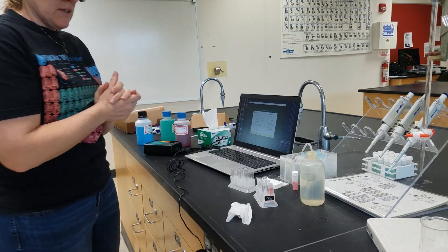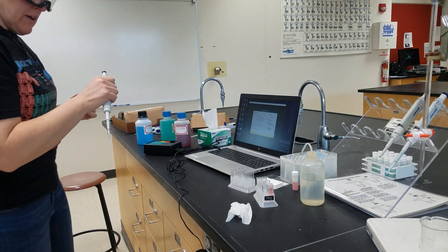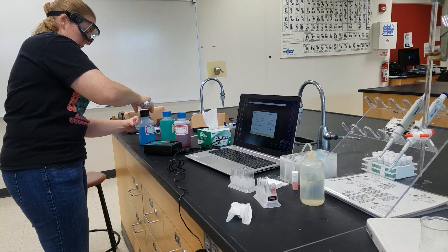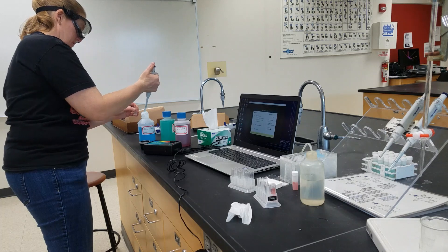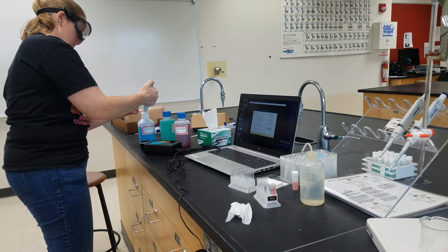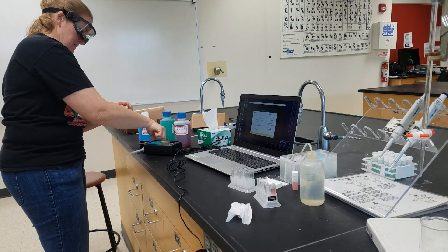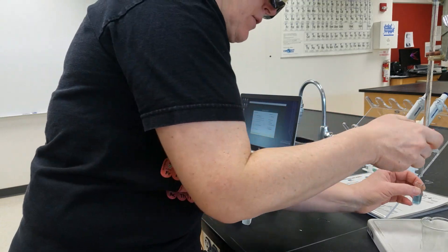We are going to prepare these the same way that we did our unknown. We do not have a repipetter set up so I am going to use my Eppendorf instead. Start with the copper, and I am going to take one and a half milliliters of the copper solution and combine it with one and a half milliliters of water.